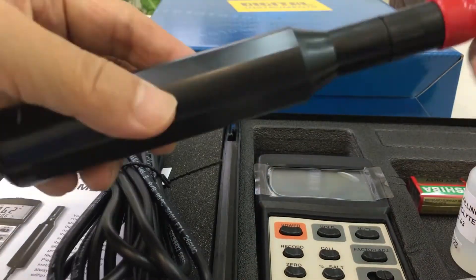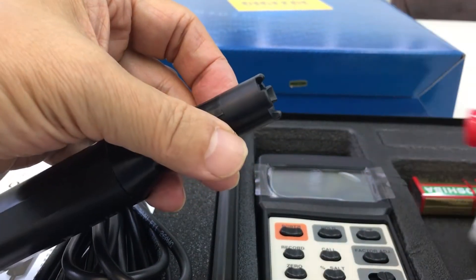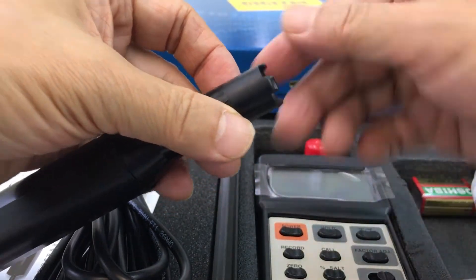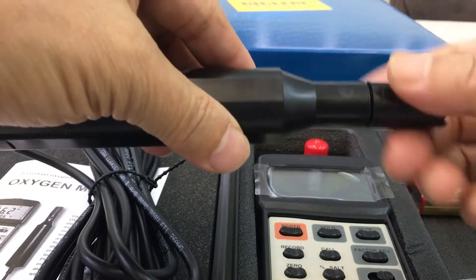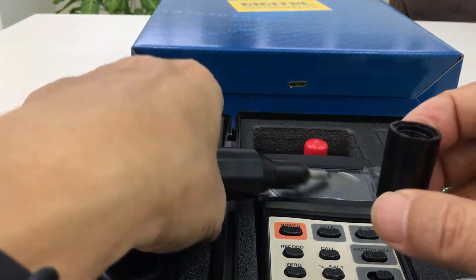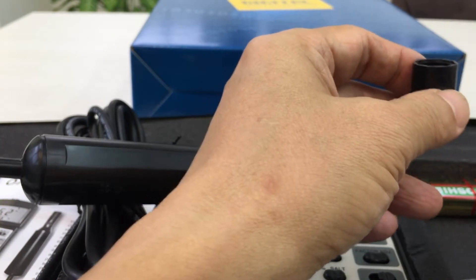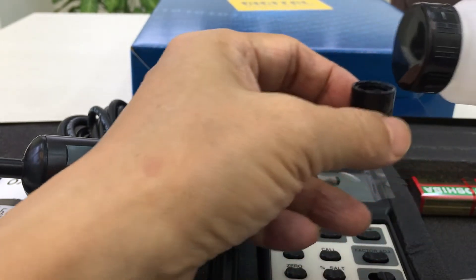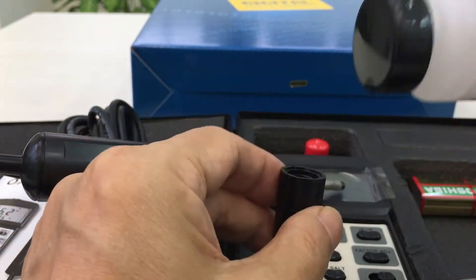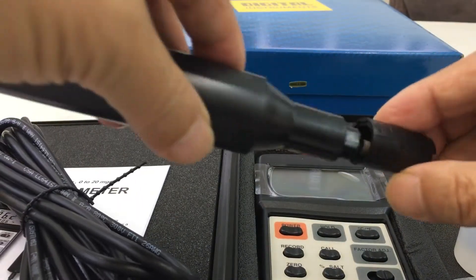When you receive it, take the red cover off and screw off this head. Pour the electrolyte liquid inside, put it into this small cap, and screw it up.